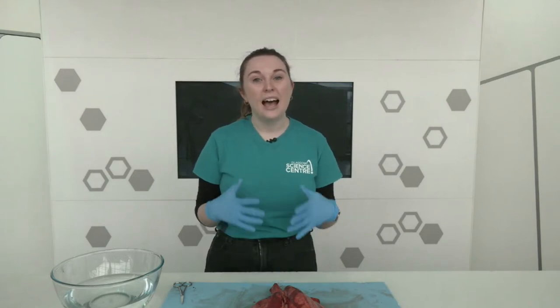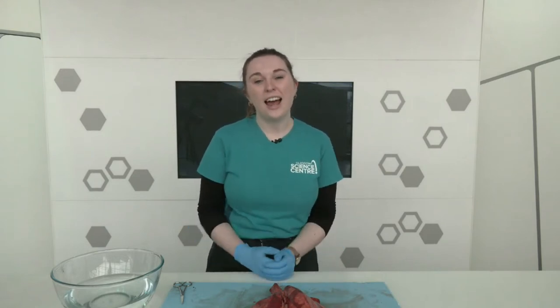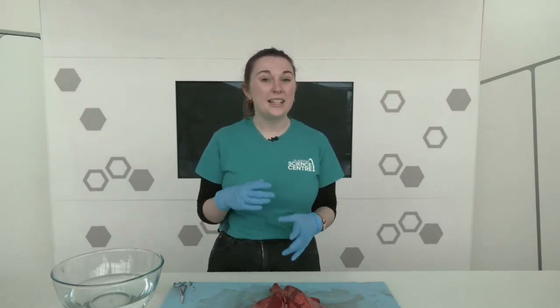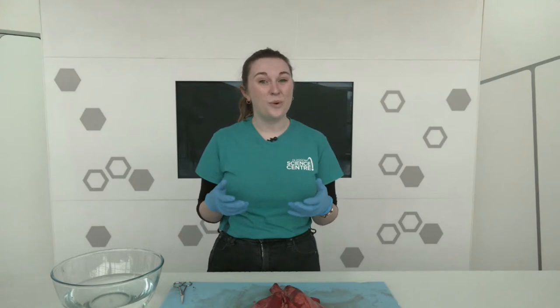Hi, Patrick. Thank you so much for having me today. And as Patrick mentioned, we are going to be looking at a pair of sheep's lungs that I have right in front of me. We're going to use them as a way to explore the structure and function of lungs within our body. So before we begin the dissection, we need to know a little bit about how our lungs work.